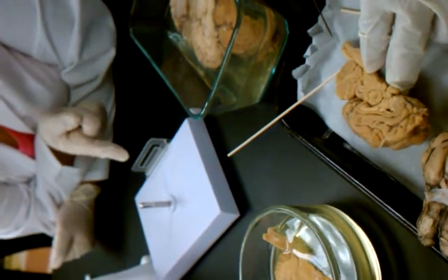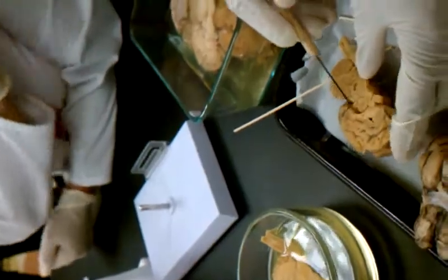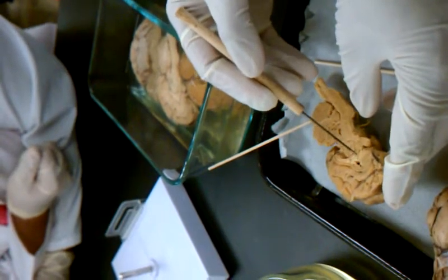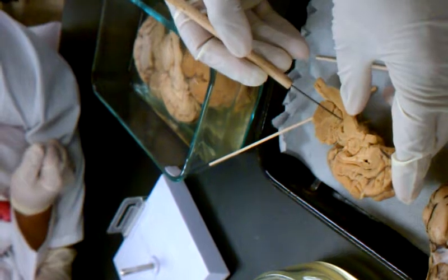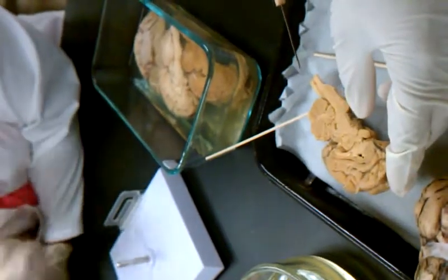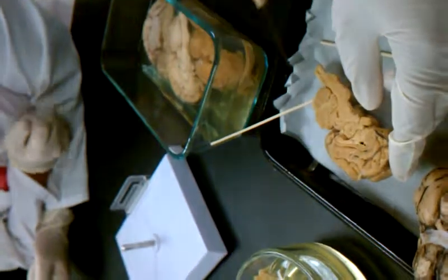It starts at the lateral and then it comes down. So basically your cerebrospinal fluid forms here, it fills the lateral ventricle, it gets out through some tiny hole here to the third ventricle, goes around, gets into the cerebral aqueduct and comes to the fourth ventricle and then gets out to the subarachnoid space below the brain. Yeah, it reabsorbs somewhere on the top of the brain.